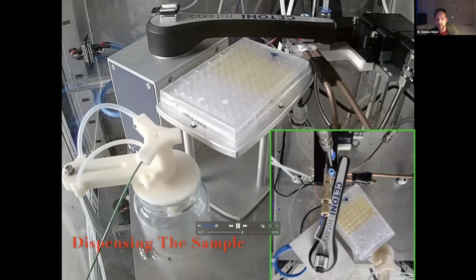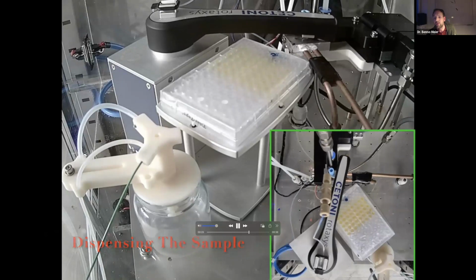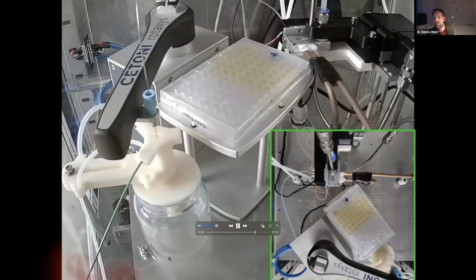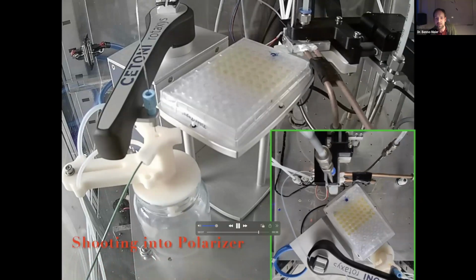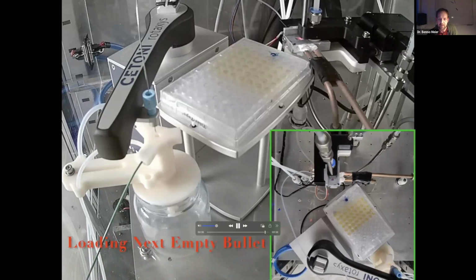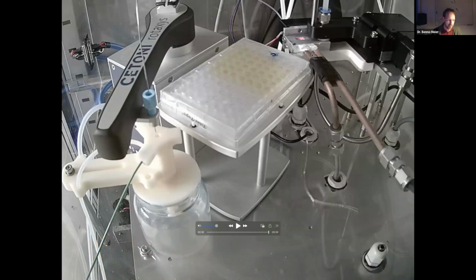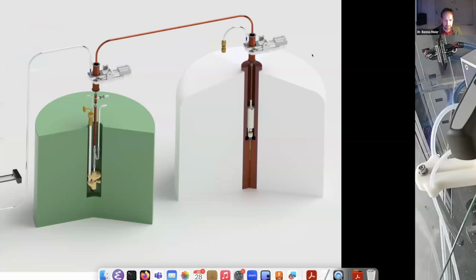Okay, and then once the dispensing is done, we run liquid nitrogen through these copper tubes. And that's a bit fast forward. That actually takes a few minutes for this copper block to cool. So we just skip that, and then we shoot it out. And then it's done. And we put the next empty bullet in. Okay, so that's how that works.